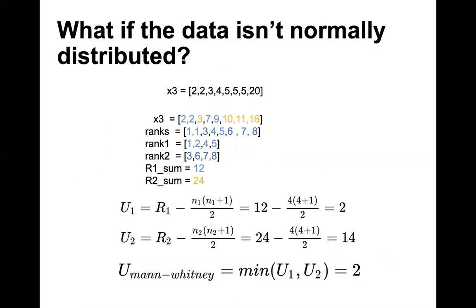that there are other solutions for when the data is not normally distributed. We know that single cell RNA sequencing data is not normally distributed because there's this huge dropout problem. We actually have counts, right? We're counting things and we know we're not counting all of them. Imagine you're doing a survey of a population and you know you're only getting 10% of the population. There's a lot of zeros we're going to see, if you didn't ask some people some questions, for example. But I just want to mention that there are other kinds of tests for this case as well.